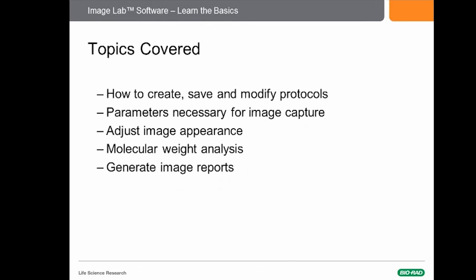So you should now have a pretty good feel of the basic features available in ImageLab, as well as protocol creation and image capture.